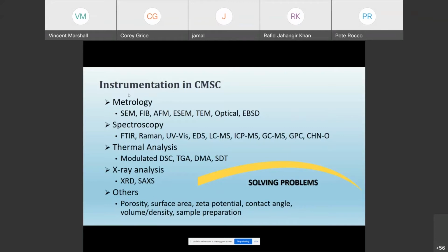Thermogravimetric analysis, so basically understanding how samples can change their weight as a function of heat and environment. So looking at things such as evaporation of samples, thermal decomposition of samples, oxidation pyrolysis, and it can be gains as well. So let's say you're trying to purposely oxidize a sample, or you can use a reducing environment and reduce that, so you can see the effects of that. SDT at the end there, that's actually simultaneous DSC and TGA measurements, so there's capability of doing both simultaneously.